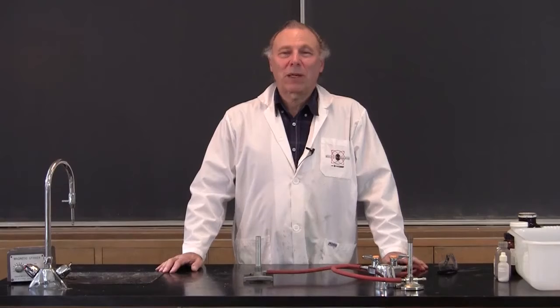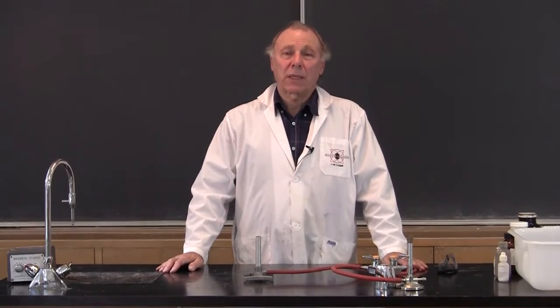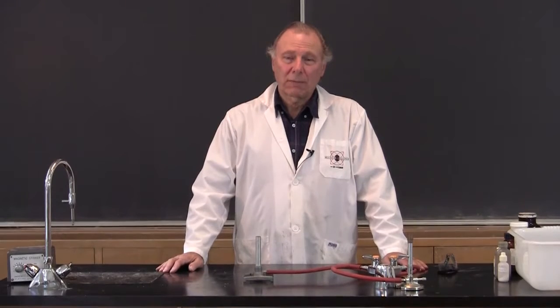Hello, my name is Peter Block, and I'd like to show you a version of flame tests which has the advantage of lasting a little longer.